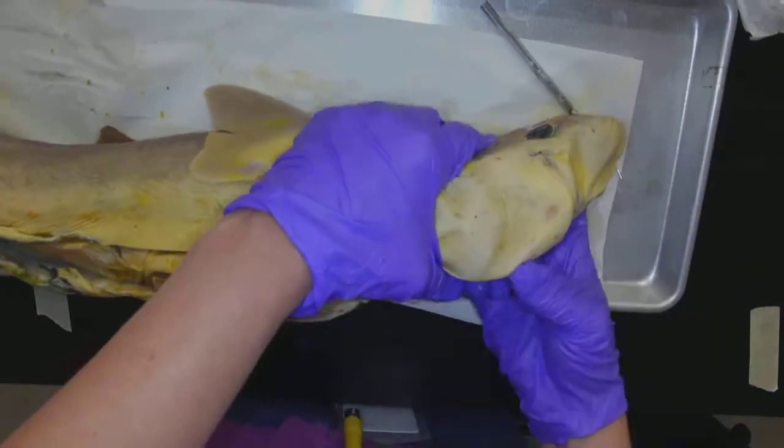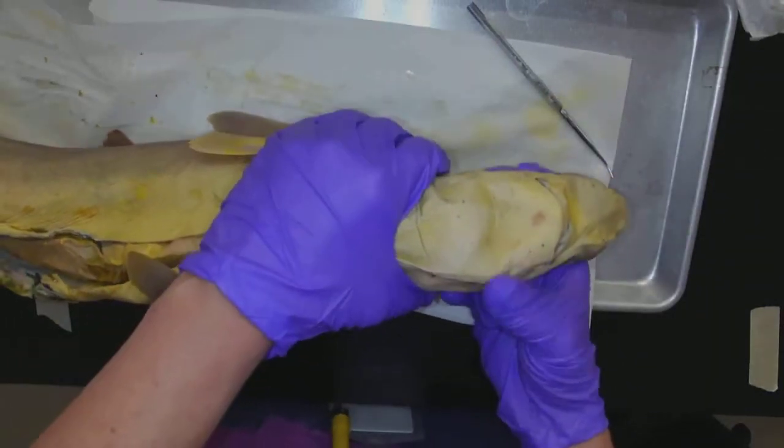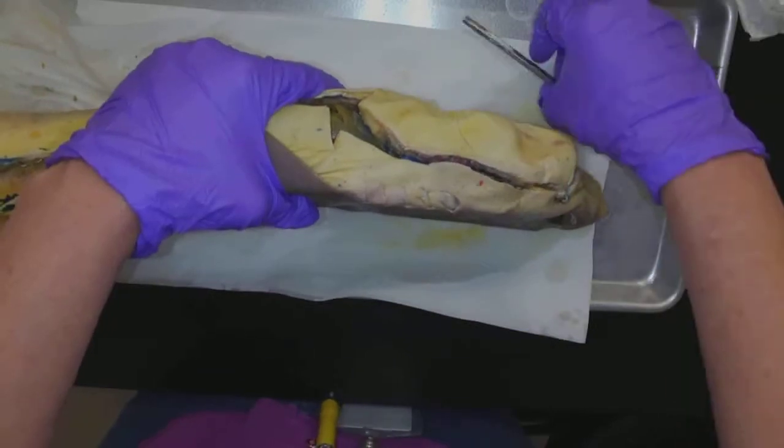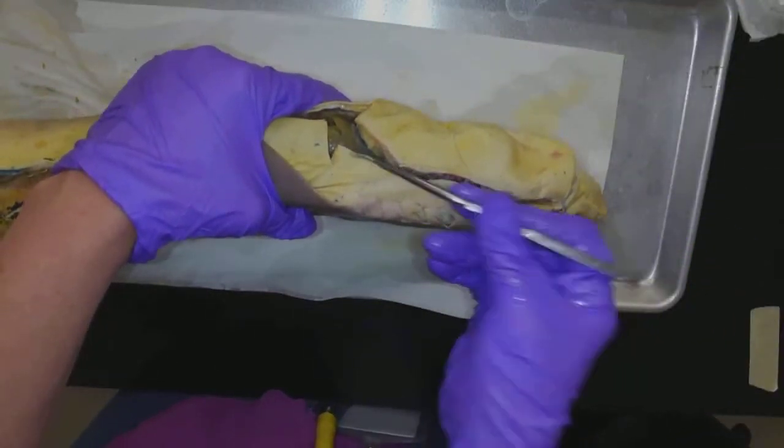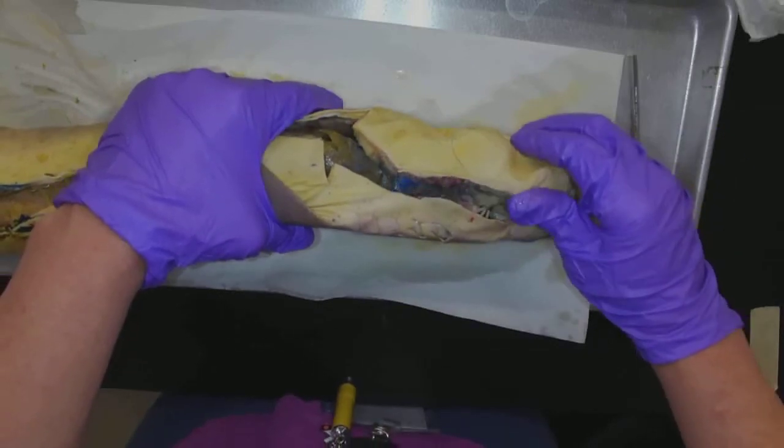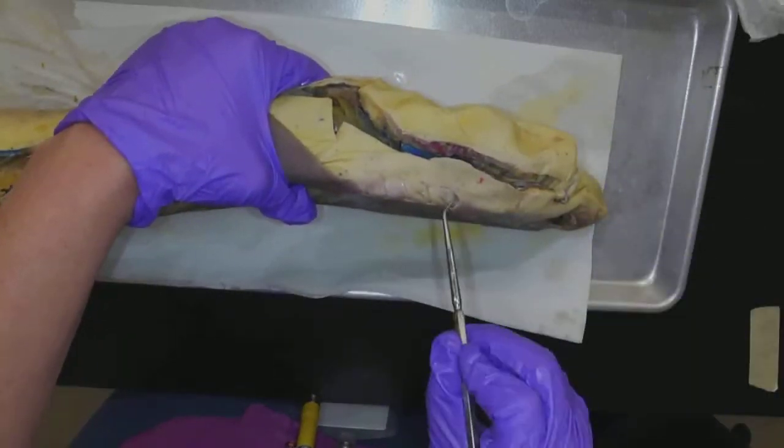So let's start at the front end of this shark. You can see that I've made an incision here from the jawline — it wasn't a super straight line. And what I did is I cut through, and we can see here the gill slits.